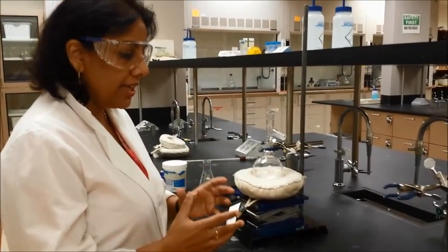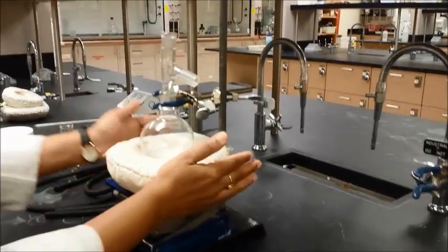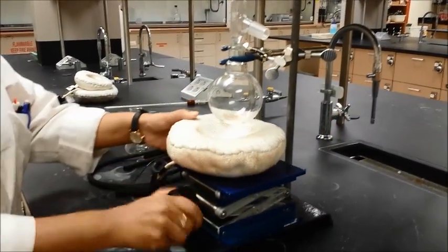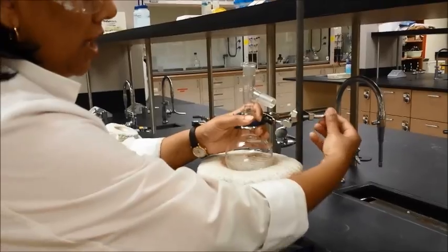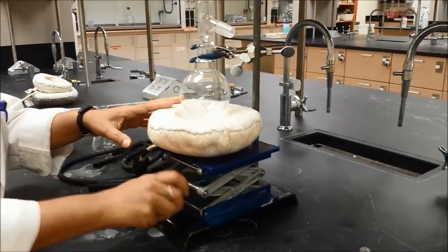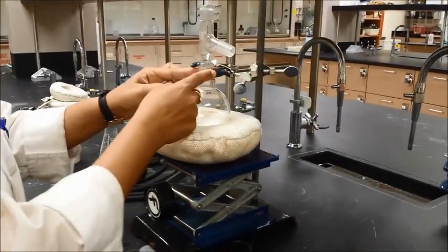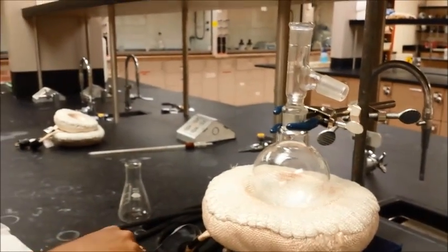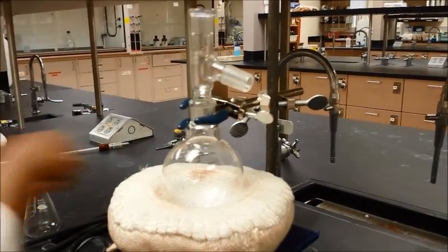Now I'm going to show you how to set everything together for the simple distillation. Here is my stand, here is the clamp, and here is the lab jack, and this is the heating mantle. You want to make sure the lab jack is a little bit higher, because later on when you need to shut the distillation off, all you have to do is lower the heating mantle using the lab jack. Set up your round bottom flask with one clamp on the neck. This is also a good time to put the boiling chips — once you have the liquid in there, put two or three boiling chips in there so you don't forget.